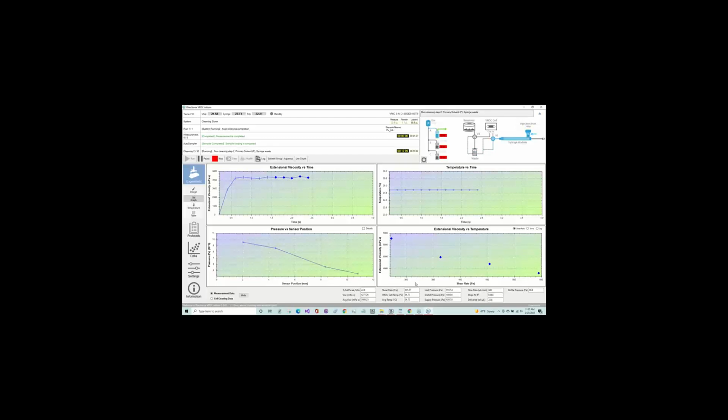So now we've moved on to cleaning, but I think we have an idea of how this will appear differently, mainly the pressure gradient. Did we have another question before we move on to the next? Not at the moment. No additional questions yet. Okay. But I will let you know.